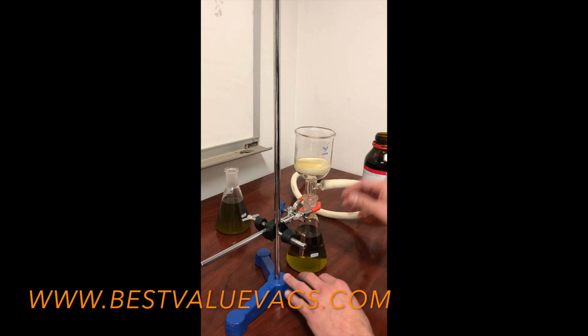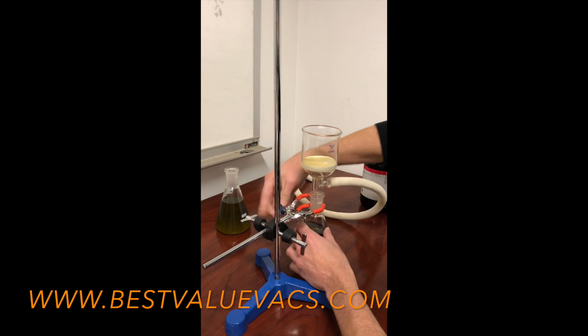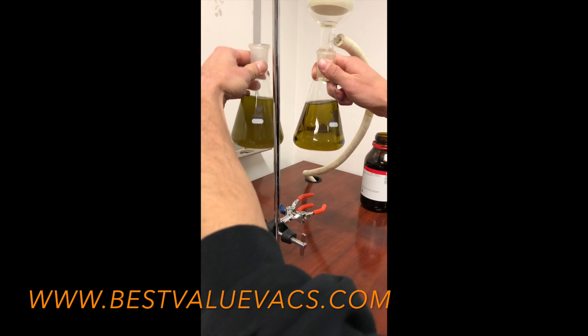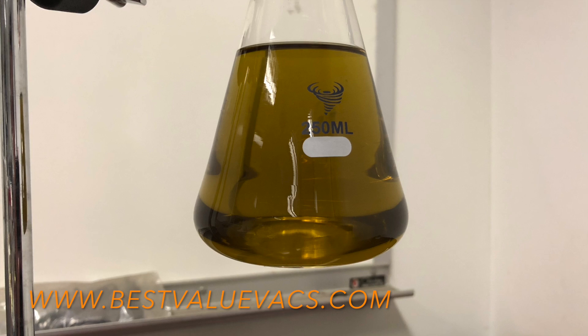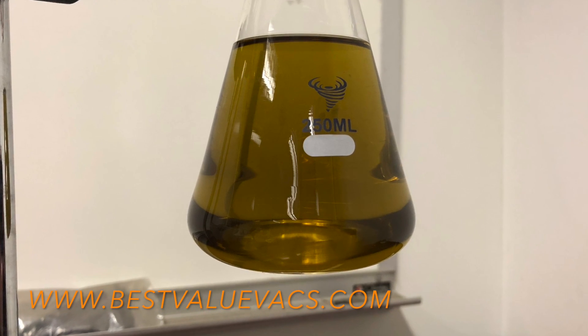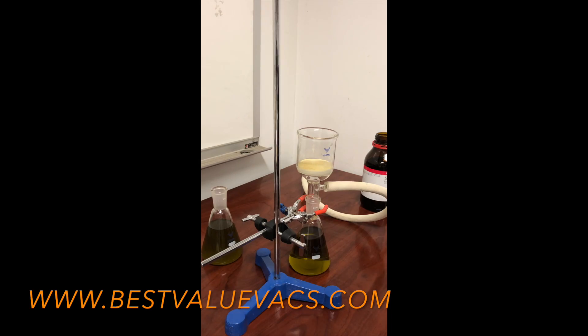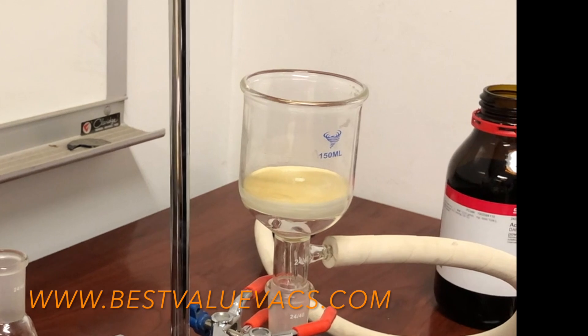The solution was pretty cloudy before, but now you can see how much clearer it's actually become — you can see right through it. It's still green though. You can also see that some of the sediment that was in the solution has been picked up and is sitting on top of the pad. If you disturb the pad you'll be able to see right underneath it — that sediment is just sitting on top.